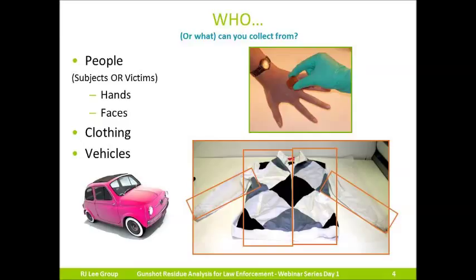Use your judgment. Think about what item is most likely to retain the most GSR after a certain amount of time has elapsed. And always, if you have any questions, just give us a call. We'll be sure to answer your questions.